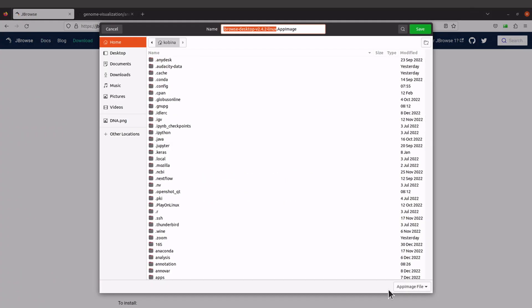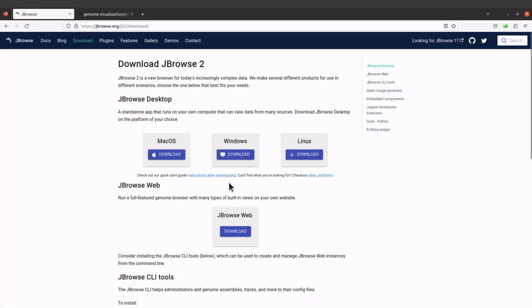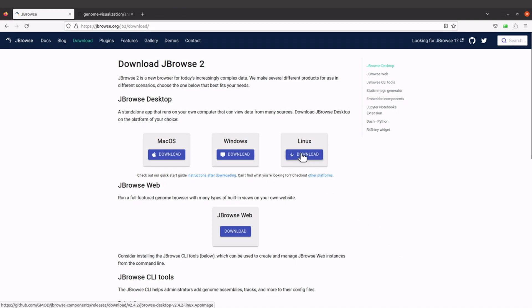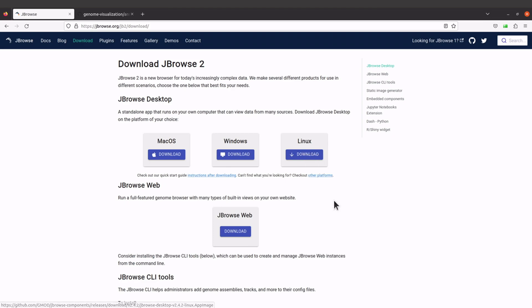You'll be asked to save the file, but I'll cancel that approach. Since I'll be working on the terminal, I'll just download using wget. I'll right-click the download button and copy the link, then move to the terminal.